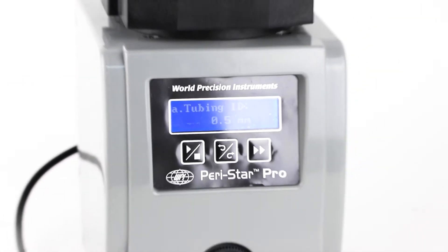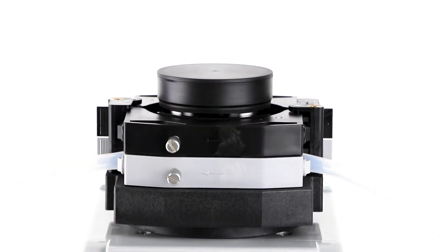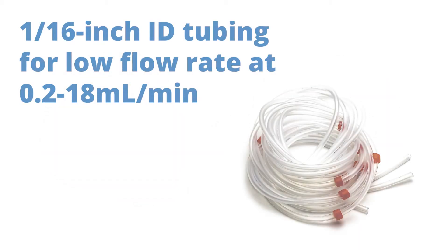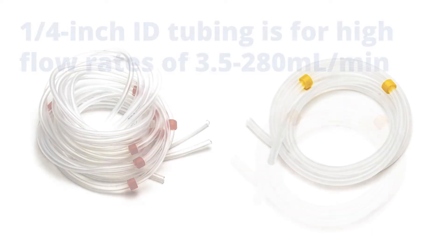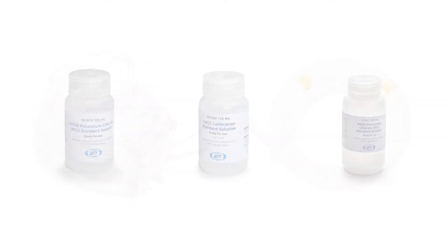In a peristaltic pump, the flow rate is determined by both the size of the tubing and the rotor speed. WPI provides two sizes of silicon tubing. The 1/16th inch inside diameter tubing is for the low flow rate of 0.2 to 18 milliliters a minute. The quarter inch tubing is for high flow rates of 3.5 to 280 milliliters per minute. Silicon tubing has a long service life and good chemical compatibility for aqueous and many other organic solvents.